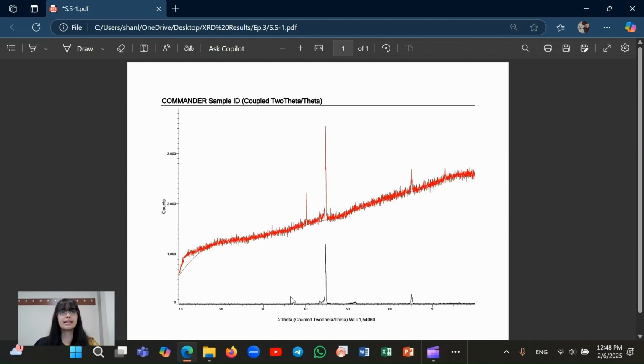The second advantage we highlighted in episode 2, which is clearly also visible when comparing this red graph and the black graph, is the smoother appearance of the black graph. This improvement is entirely due to the XET detector's excellent and complete fluorescence filtering capability for iron. So, the black diagram, as you can see, is totally smooth.